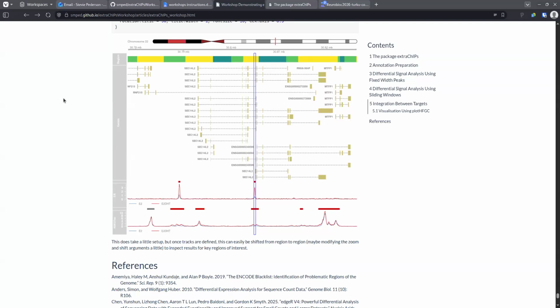And then the track below that is H3K27AC, and you can see the windows I've highlighted in the middle where we've got change in both, what the genes are and where they map to. So these are mapping to a promoter by the looks. So, handy little function. If you've got results and you just want to go, look at this peak, look at this peak, look at this peak, just set yourself up the objects and just scan through 20 peaks in no time at all. All right, we're out of time.